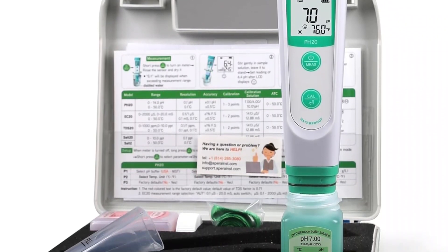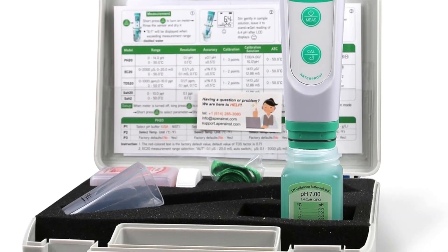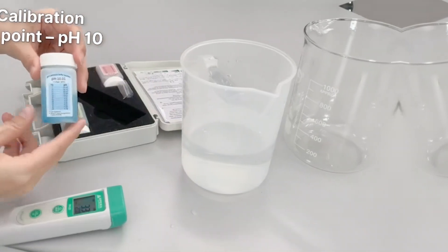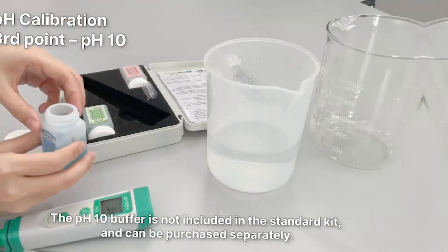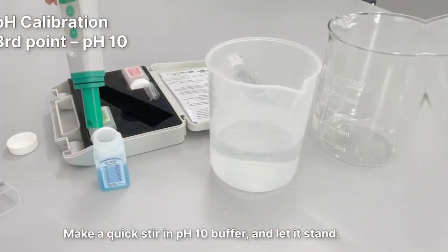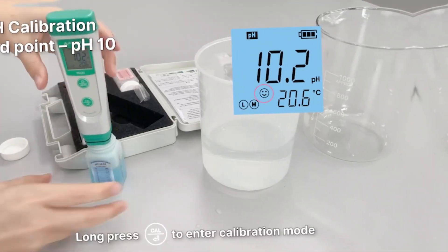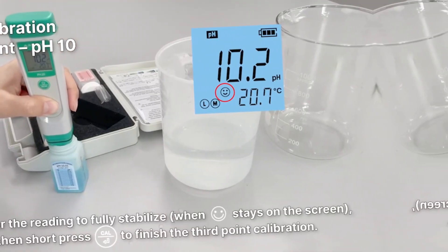Calibration is simple and quick, guiding you step by step to ensure maximum accuracy. The price is higher than basic models, but it makes up for it with professional construction, superior durability, and advanced precision. If you're looking for long-term quality, it's an excellent investment.